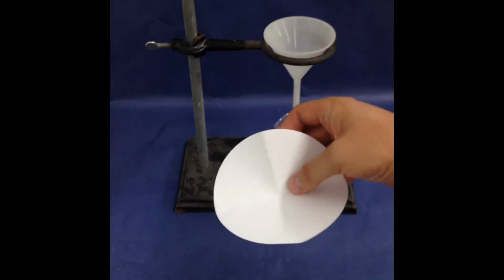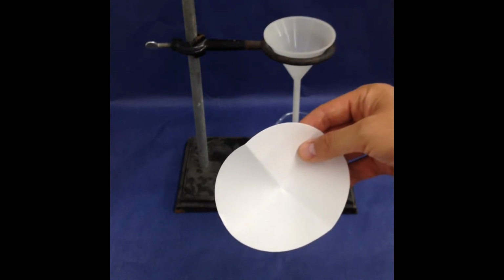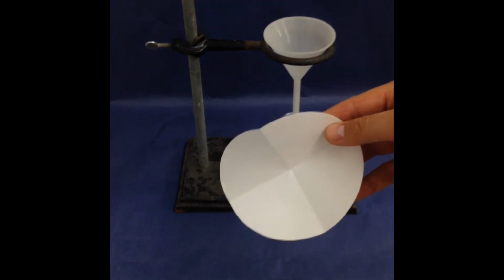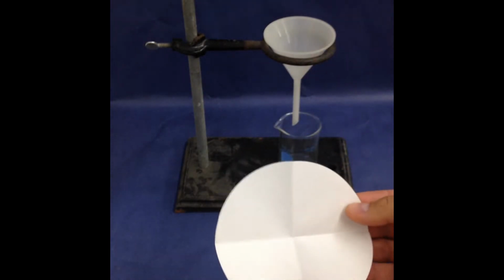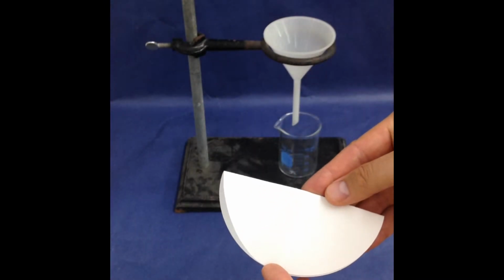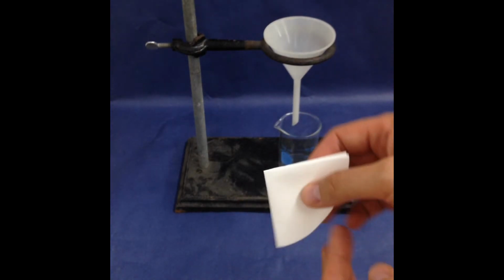You're going to use it to separate solids and liquids, and you'll need to get a piece of filter paper in order to do that. Your instructor will probably give you a paper circle like this one that's been specially sized to fit inside of your funnel. So when you get this piece of paper, you're going to fold it in half to make a semicircle, and then you'll fold it in half again, and you'll have now a quarter of the circle, right?